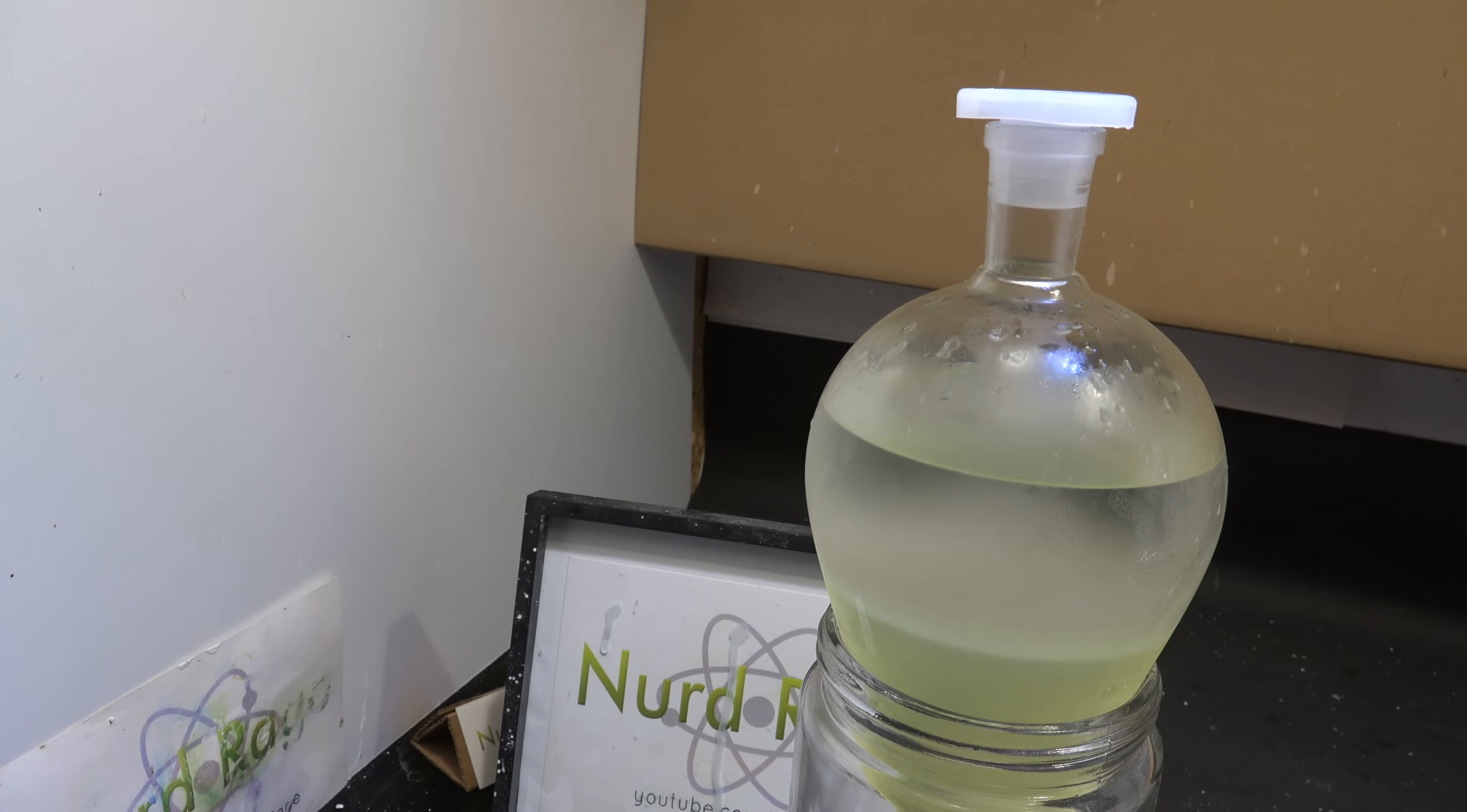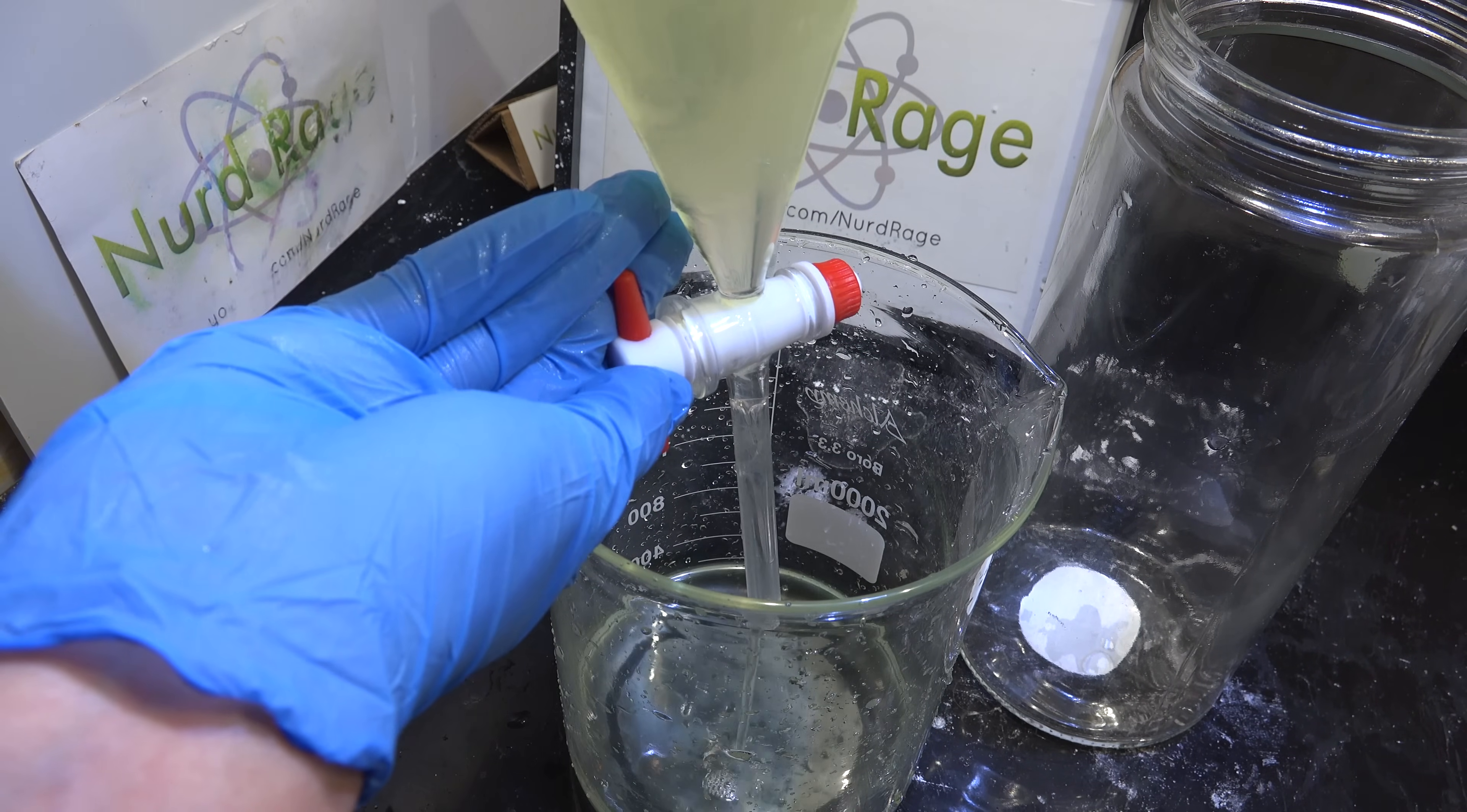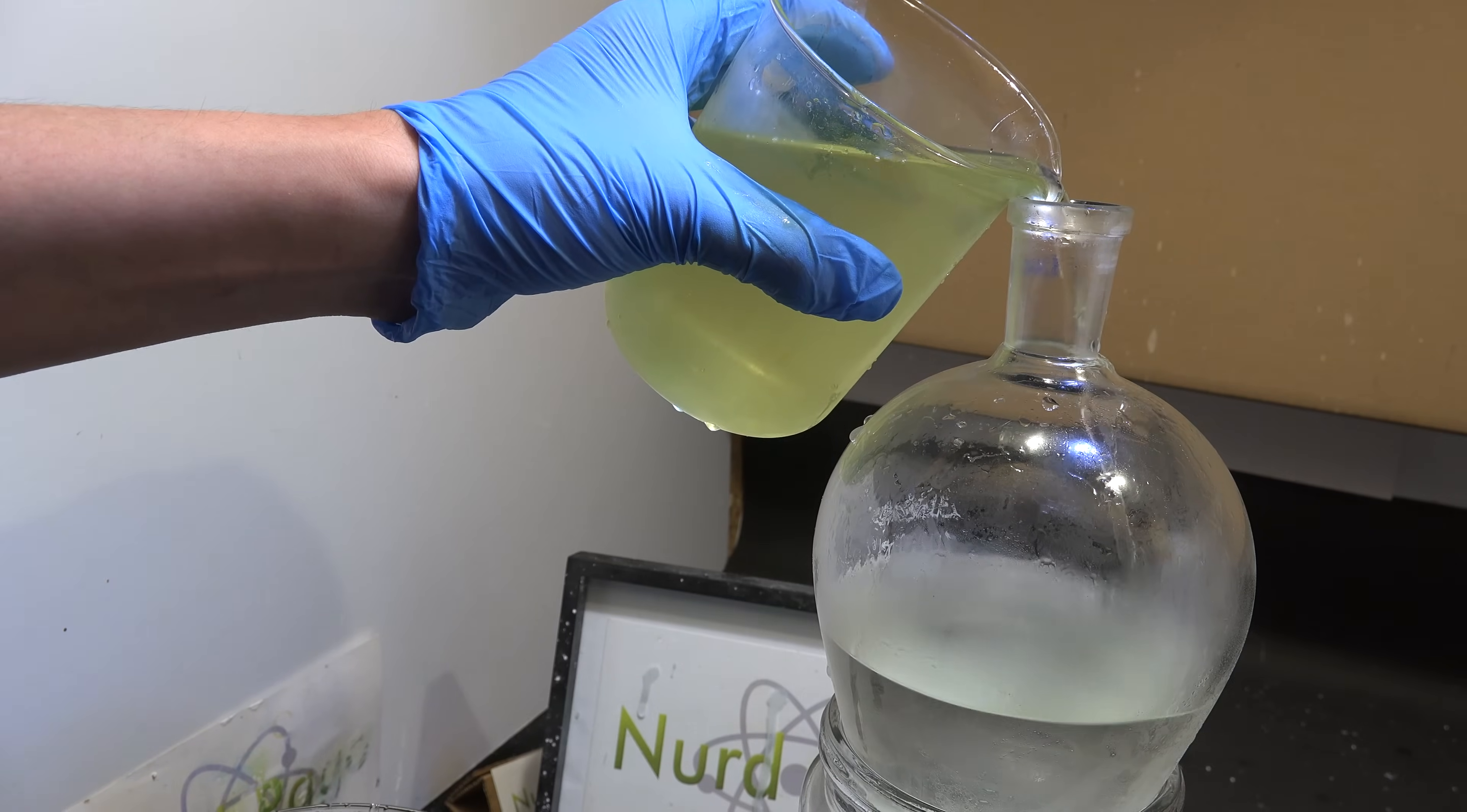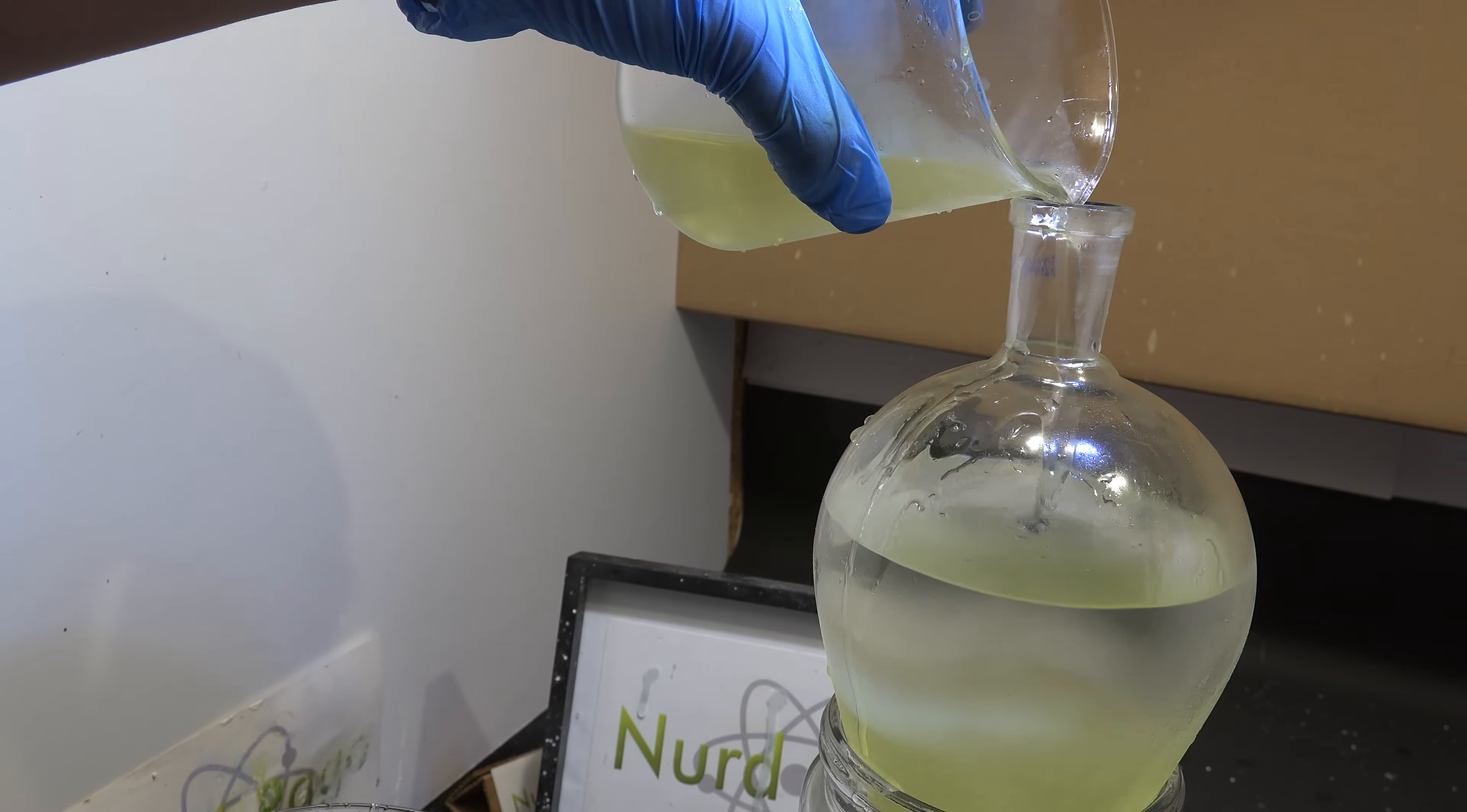After a few minutes of shaking, let the contents settle and drain out the bottom aqueous layer. This should be depleted in gallium chloride. Keep the upper organic layer of ether. Now I have a lot more solution so now I'm going to add another 500mL of it to the ether and extract more gallium chloride.